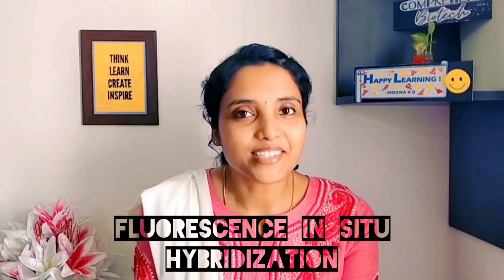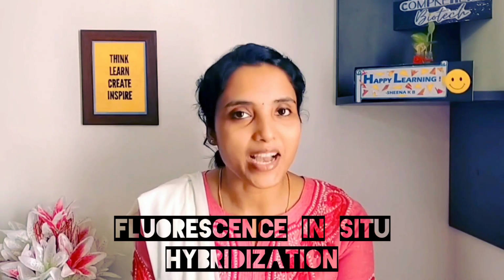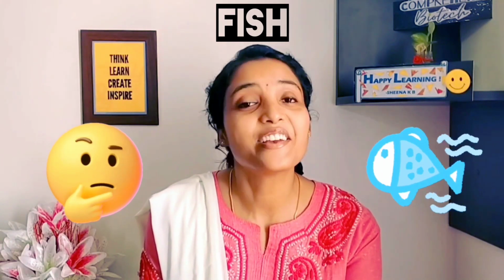The topic for discussion today is fluorescent in-situ hybridization, commonly known as FISH. Yes, you heard it right, FISH.